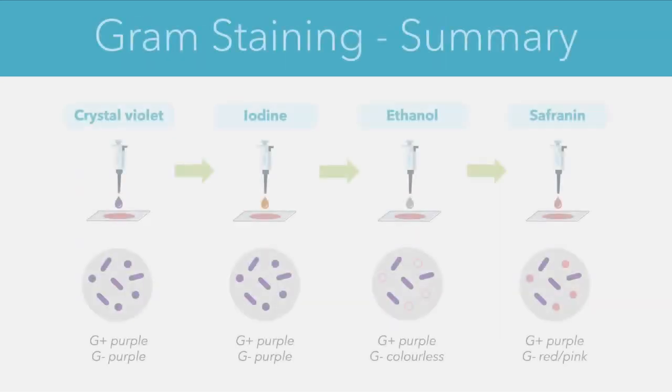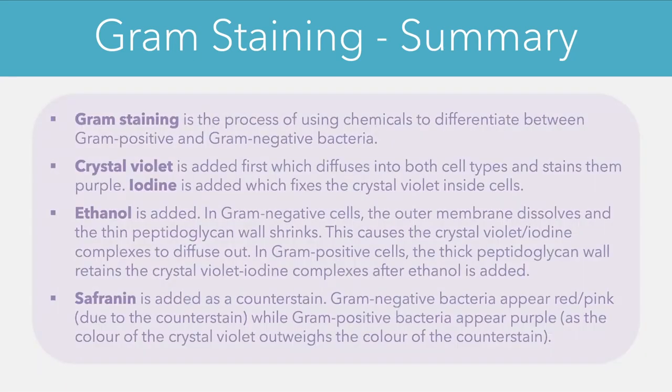To finish off, we have a summary slide here which outlines the key steps involved in the gram staining technique, and we also have a textual summary here.